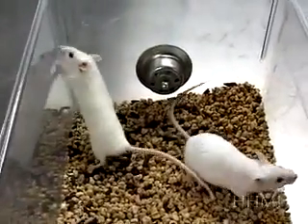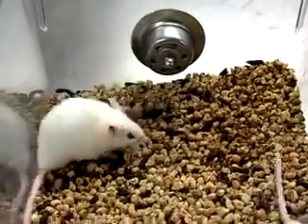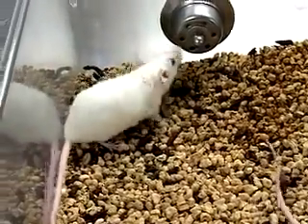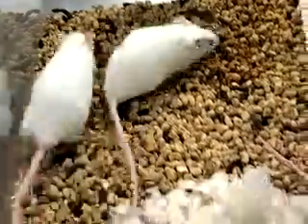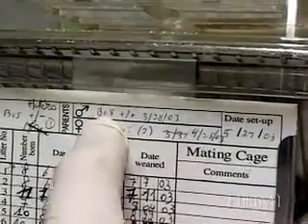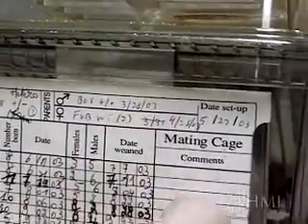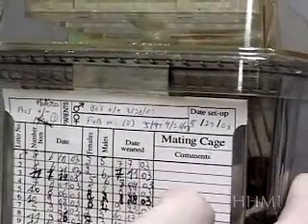Mice that have the transgene are bred with wild-type mice. The offspring are again tested for the presence of the transgene. It is important to check that the transgene can be stably transmitted to the next generation in order to establish a line of mice that carries a new gene.